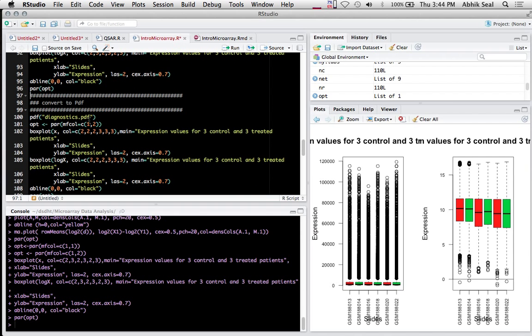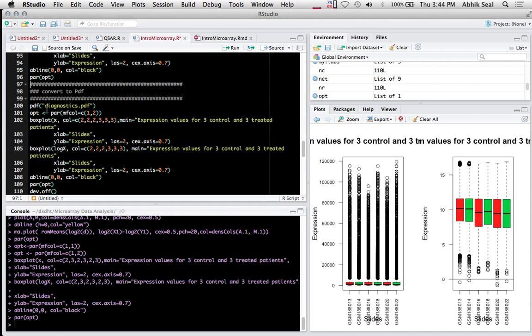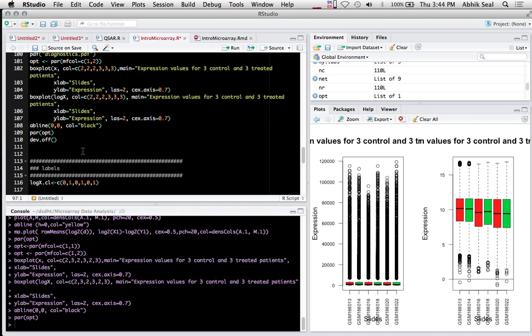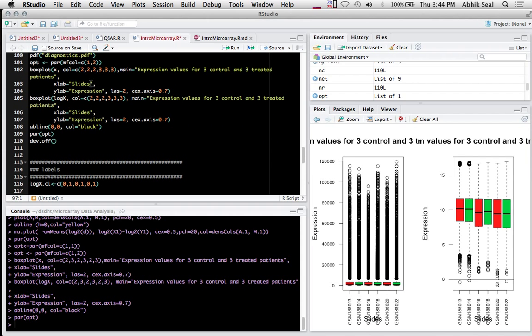You can also convert this to PDF for diagnostics. Plot the plots and export as PDF. Remember to use dev.off - if you don't use dev.off, you can't open the PDF file.